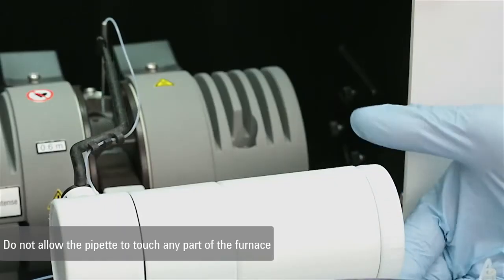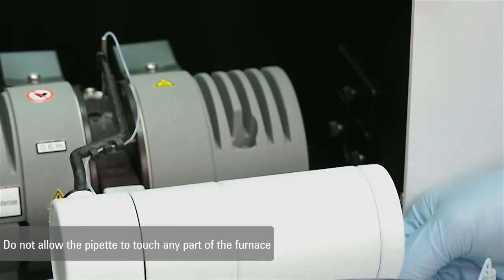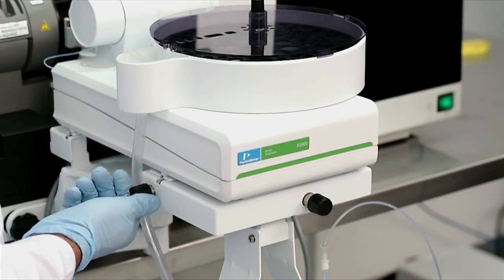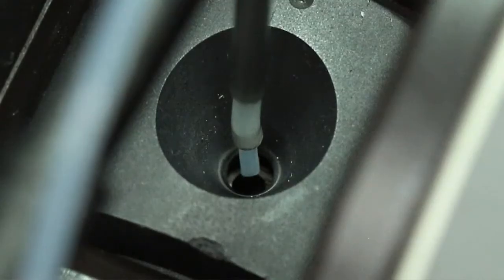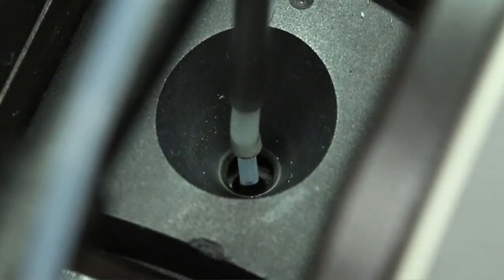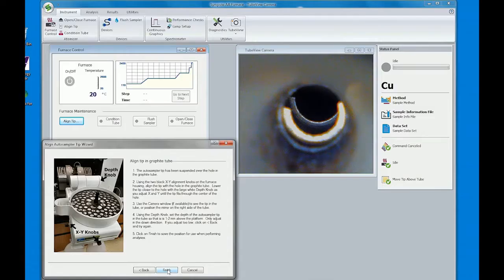Use the depth control wheel to lower the pipette tip until it is just above the graphite tube. Continue lowering the tip and adjusting its position left and right, forward and backward until the pipette tip is positioned just inside the injection hole of the graphite tube.